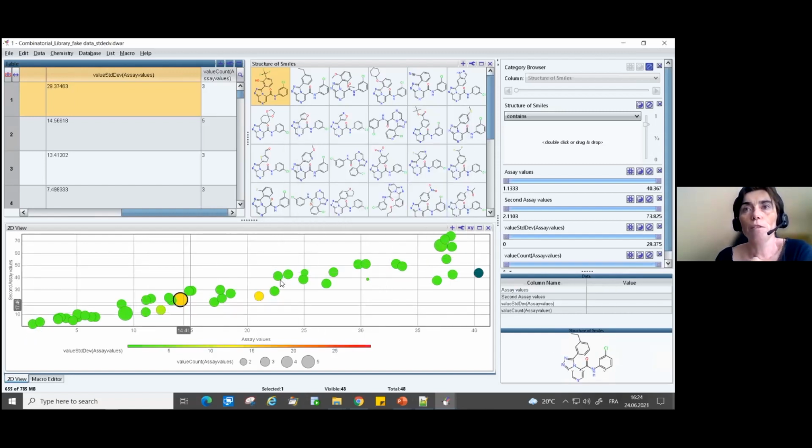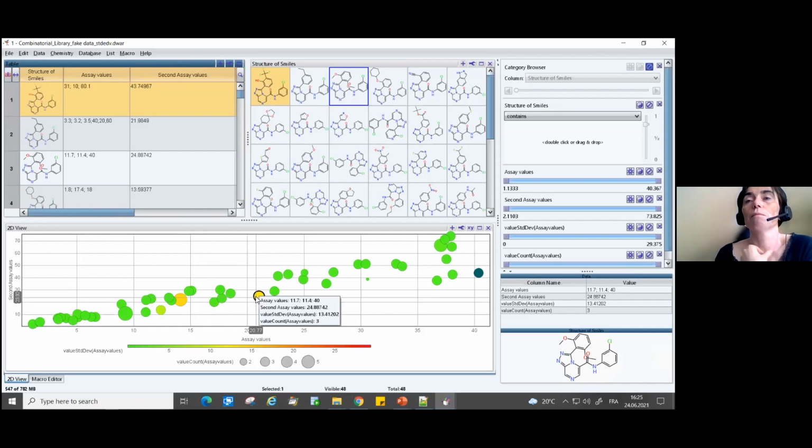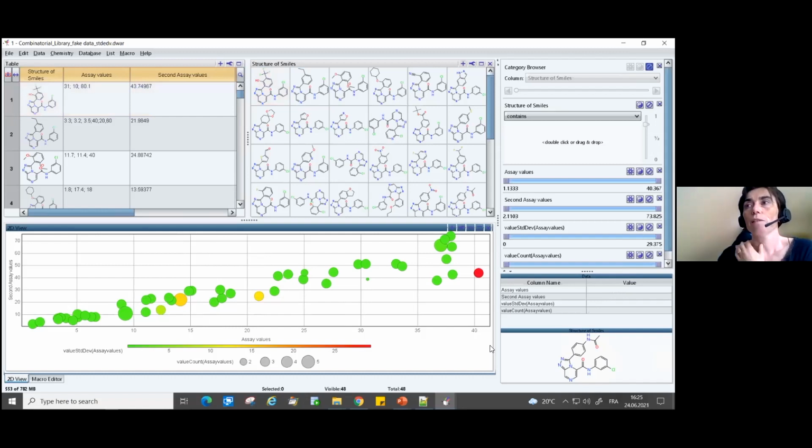So you have the same information, meaning you have your compounds sorted by the activity on 2 fictional targets. But on top of that, you also have the information whether the measurements can be considered as reliable or not. This was a very bad point.